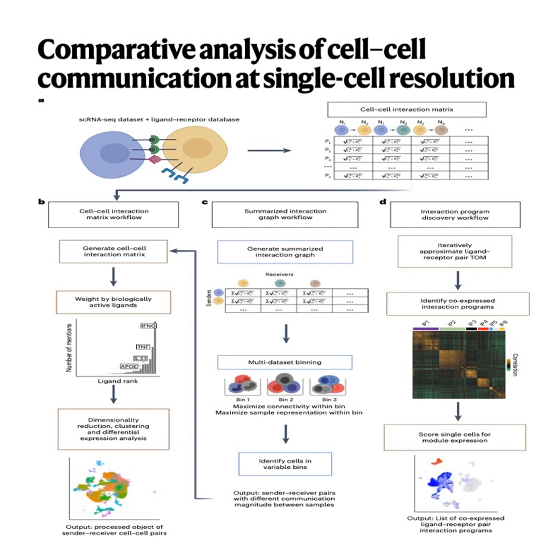Types of interactions. Yeah, think of it like finding recipes. Are there groups of specific ligands and receptors that tend to be used together over and over again by cells that are themselves transcriptionally similar? They adapt a method called WGCNA, which is normally used for finding co-expressed genes, but they apply it to find co-expressed ligand-receptor pairs. So finding modules of communication signals that act like a coordinated unit. Exactly. They call these modules interaction programs, or IPs. It's like discovering the common communication protocols or blueprints being used in the tissue.